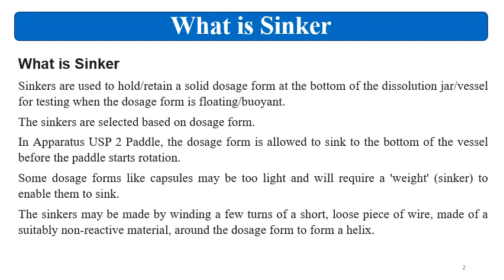That's why the dissolution topic is very important. In this video we will discuss the use of sinkers.